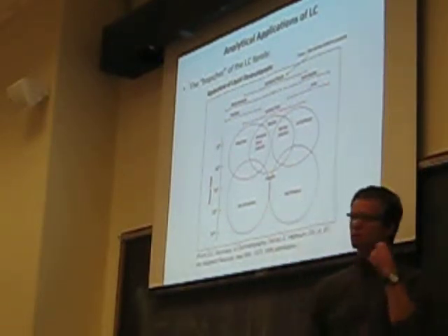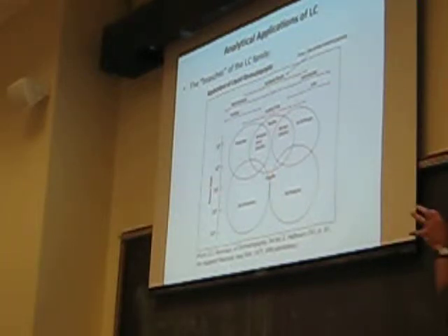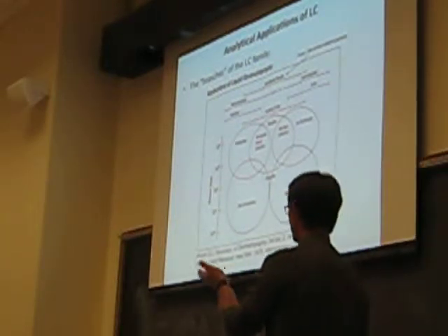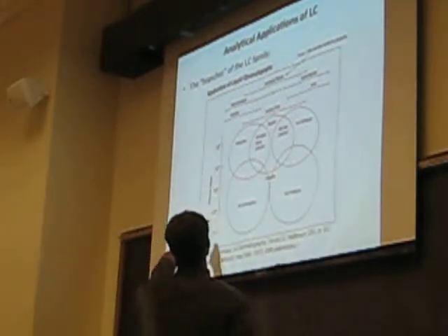Right? And a lot of times when you start doing a size exclusion, you have to first demonstrate that there's no chemical interaction, like hydrophobic or hydrophilic interactions between the molecules you want to separate and the matrix.